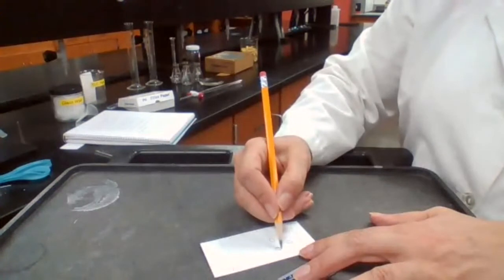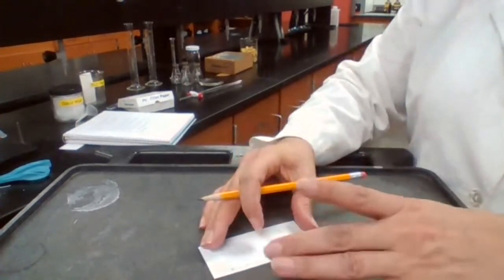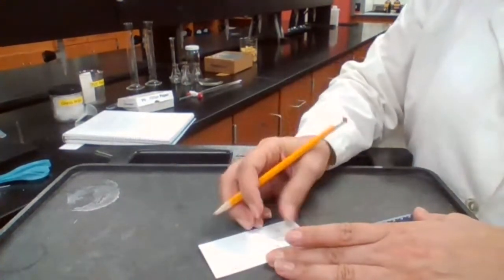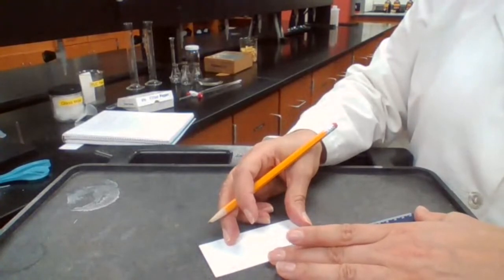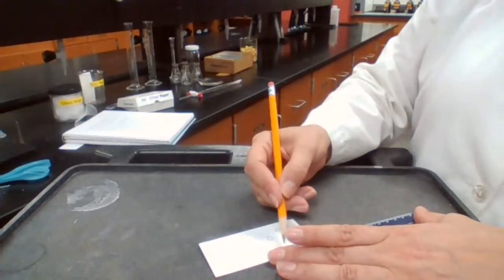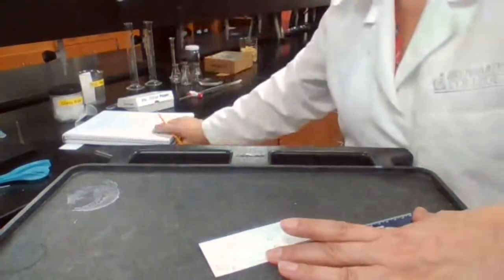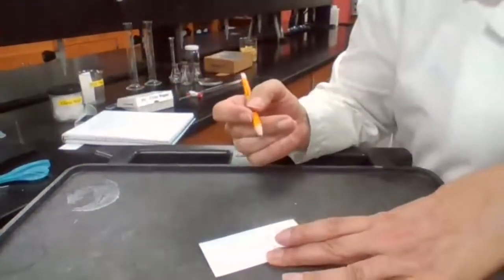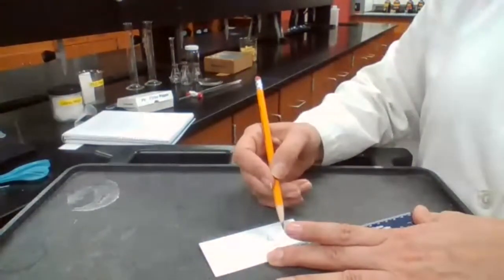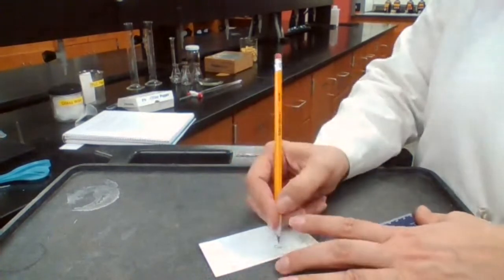For compound 1, I'm going from center to the line, and I will show you now. Compound 1 is known sample 1. Based on the chart, you know which one it is, right? Based on the chart we had, the first one was aspirin, and that number is 2.7, sorry, 2.6.